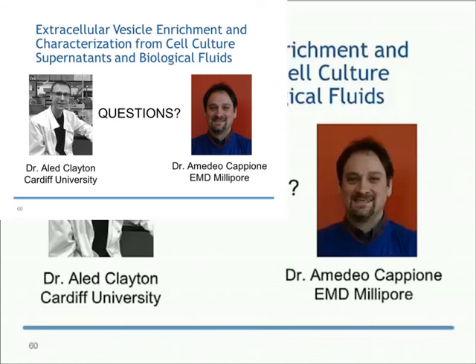I totally agree with that, Amedeo. We use bovine serum that we prepare in our lab. We deplete by spinning hard overnight. And this gives us a good elimination. It doesn't get rid of everything, but it gives us, we think, around 90 to 95% depletion of bovine vesicles in the system.